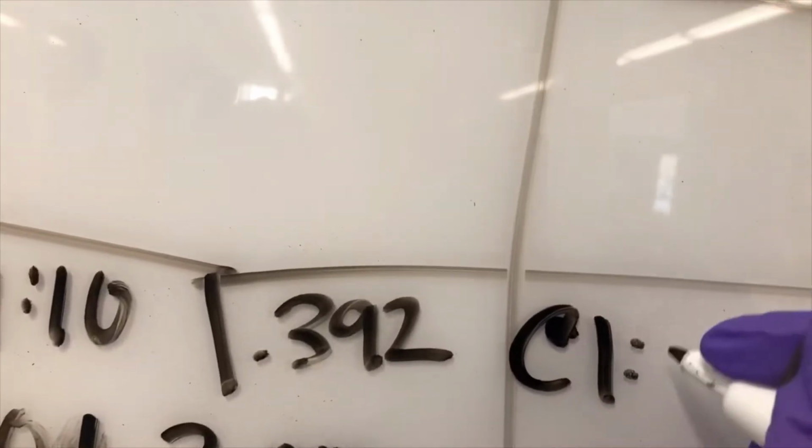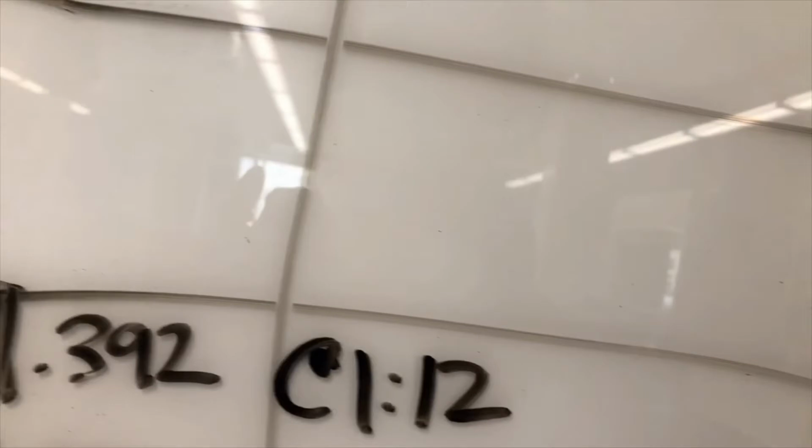So I will add that at 1:12. It is now 0.473. And I'm going to wait 3 minutes and do it again.